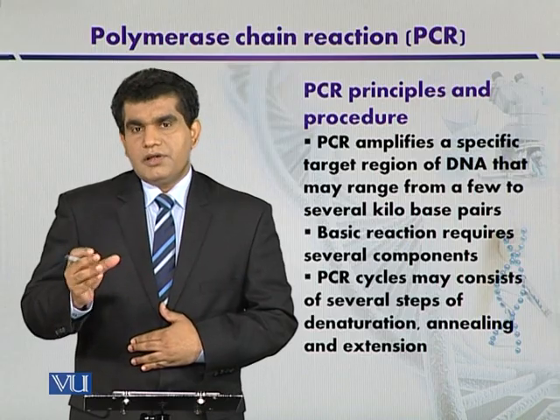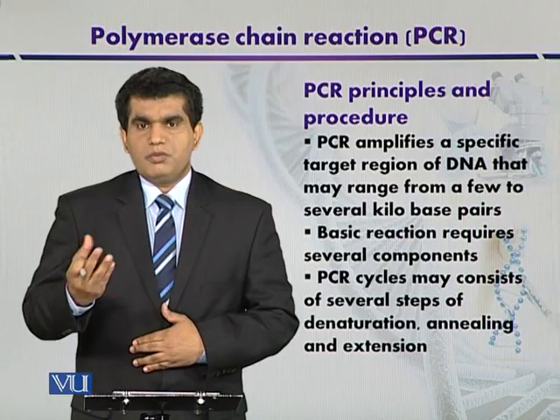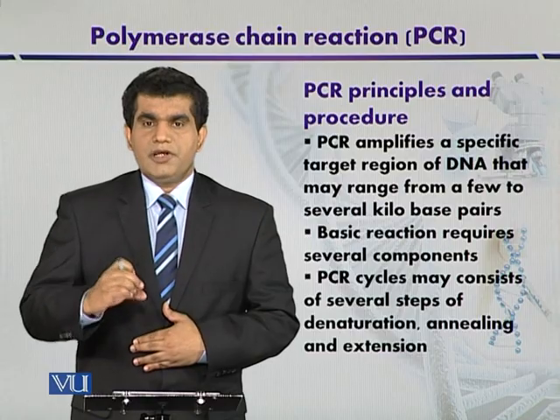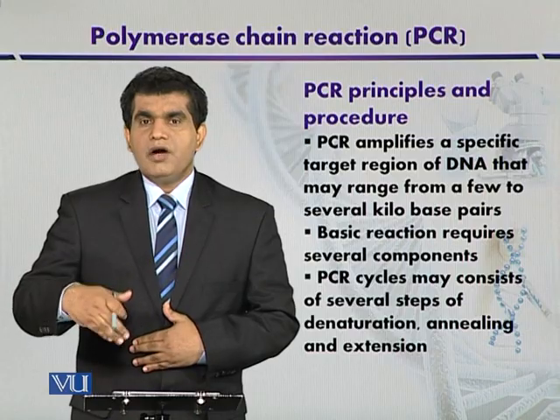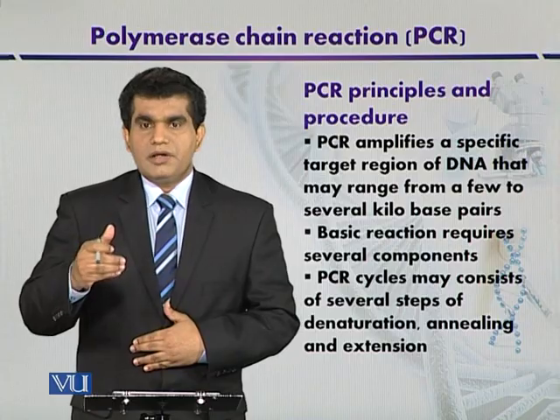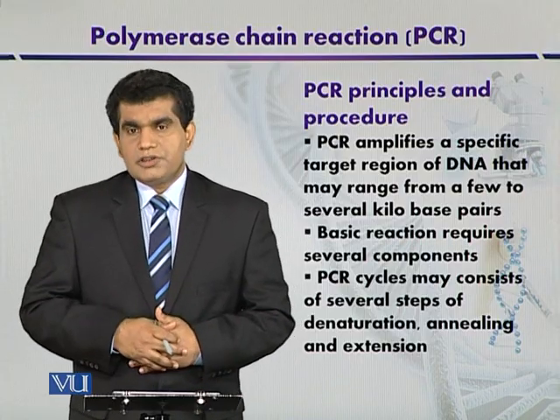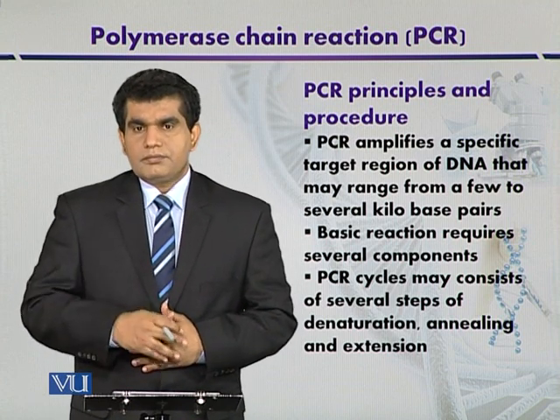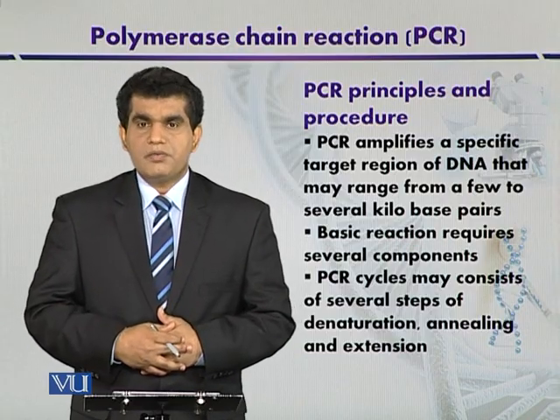Now we have the reaction mixture in Eppendorf tubes that may have the size of around 0.2 to 0.5 ml, and in this tube the reaction mixture we can manage in different volume. It depends on our own requirement कि हम कितना वॉल्यूम जो है वो एम्पलीफाई करना चाह रहे हैं. लाइक इसमें हम 10 माइक्रोलीटर का भी रिएक्शन मिक्सचर यूज़ कर सकते हैं, 25, 50, 100, 200. It depends that how much amplified DNA we have the requirement.